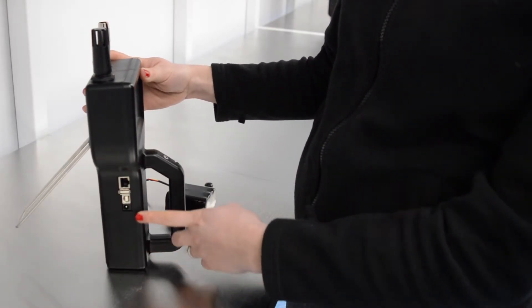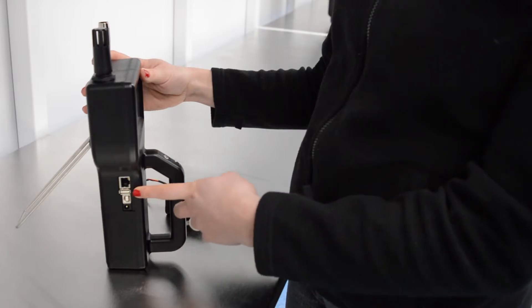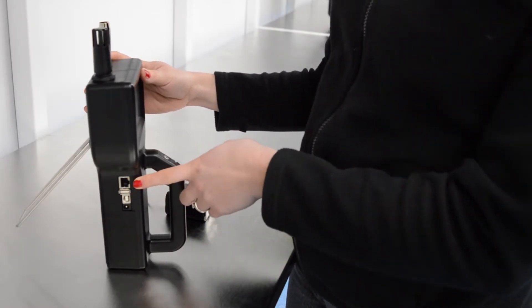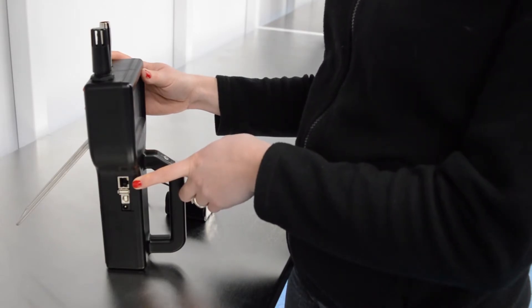There are four sockets here for connection to different cables: one for power, one for the lightning cable, a USB port, and the network connection. Some units also have Bluetooth and Wi-Fi options, so you can connect without cables.